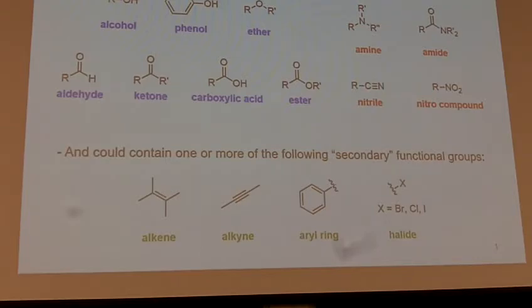So you also need to test for alkenes and alkynes. That means everybody will need to do the bromine test, everyone will need to do the permanganate test, okay? Whether you have an oxygen-containing group or nitrogen-containing group, you'll need to figure out if you have that. We remember with the bromine test, when it's turning positive, it could go on forever of you adding drops of bromine, it's still decolorizing. Stop that test at like 20, 25 drops. Most likely if you've got that far and it's still decolorizing, that's probably a sign of a positive test, okay?